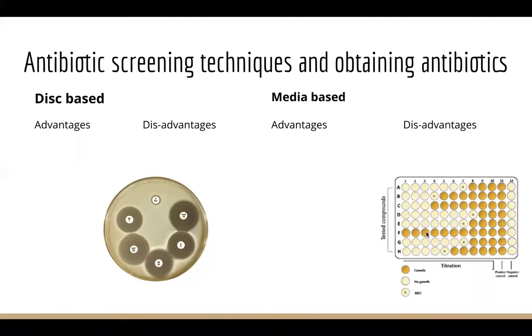The advantage of media-based is that you can use liquid-based antibiotics, and you can provide the MICs for various compounds that you might want to test. It may be a new antibiotic. So if you've been looking for a natural antibiotic and you want to increase the concentration, you can find a good MIC from that, and it's better data than you might have from a disc, which only has a certain concentration gradient. You can see there's a small amount of inhibition here, but it really does depend what you want to do and your style, I suppose.